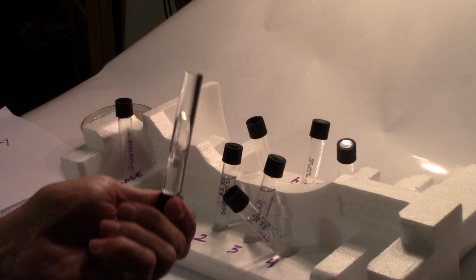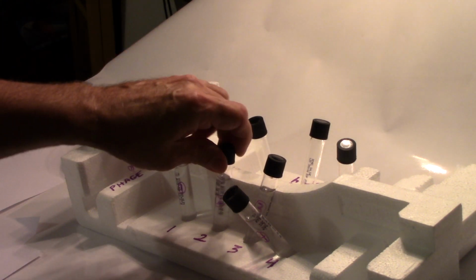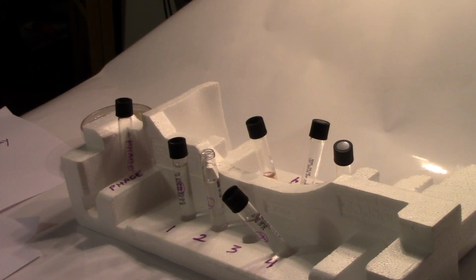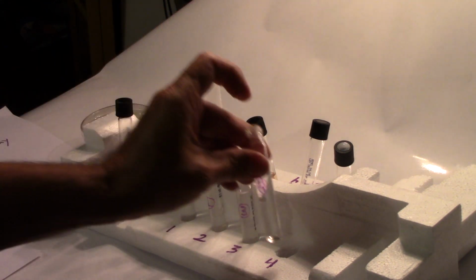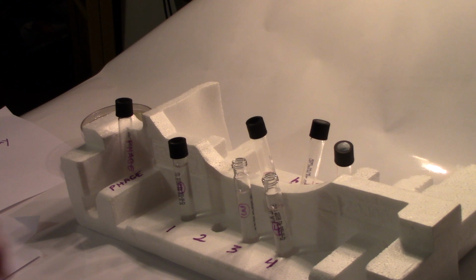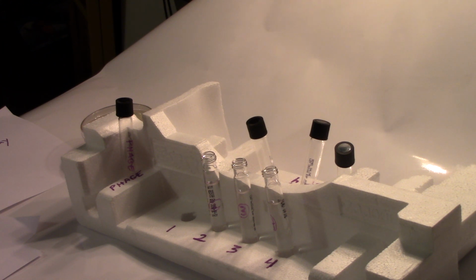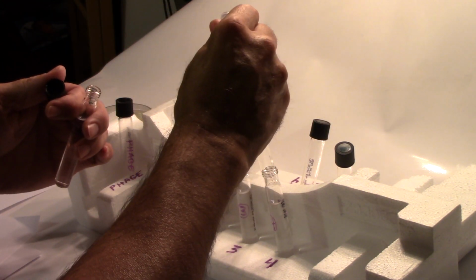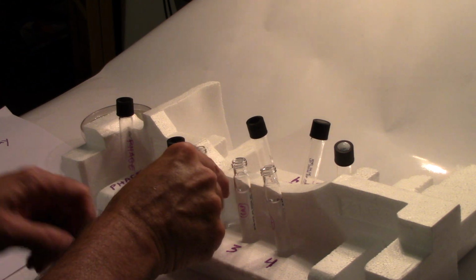Okay. Get a fresh pipette. I'm going to open up these other tubes, carry out the serial dilution. Okay, so I'm going to take 1 part from this first dilution, add it to my next 9, get a new pipette, mix this.